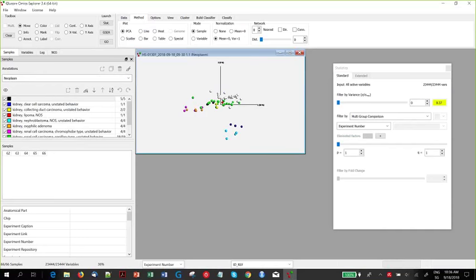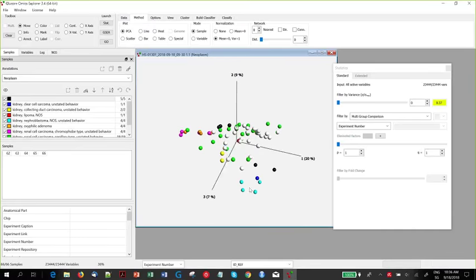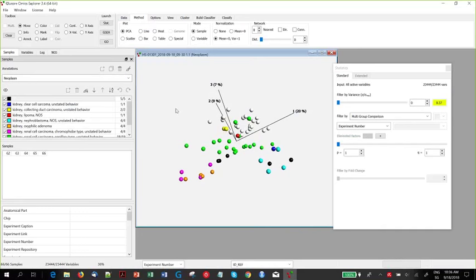And we can color our data set and keep working with it, as from the beginning of this webinar, we can explore this data set in Qlucore. So this all demonstrates a direct path between a compendium-wide analysis tool with a deeply curated database to an interactive statistical tool for visual exploration.